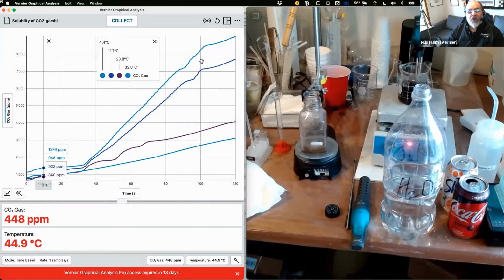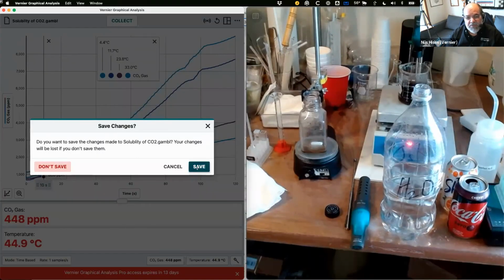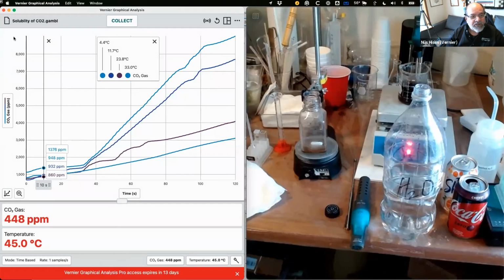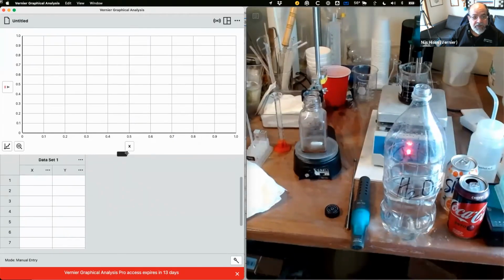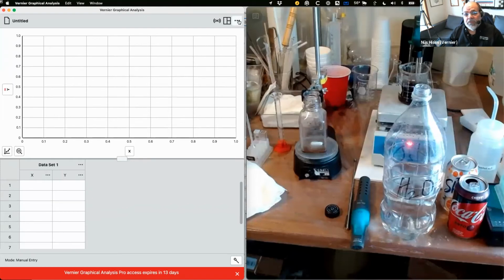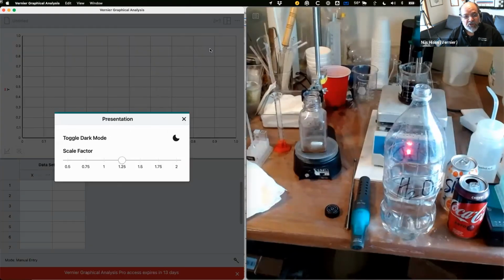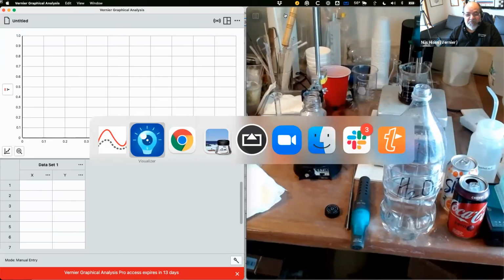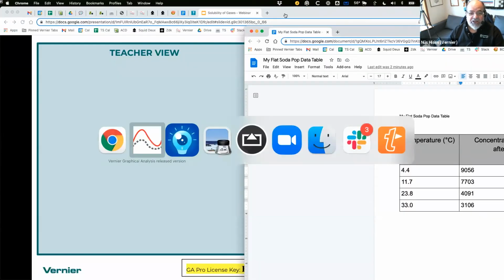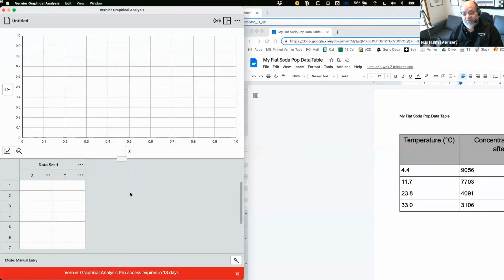Okay? So I'm going to start a new experiment. And this time, and I did save it, but I'll just do it again just for kicks here, I'm going to do a manual entry. Okay, and if you want to follow along, absolutely, please follow along with me. Because we are going to build the archetypical solubility graph right now, but we're going to do it for gases rather than for solids.